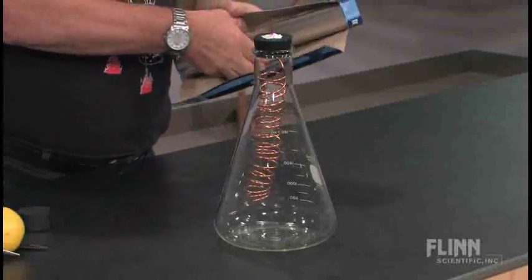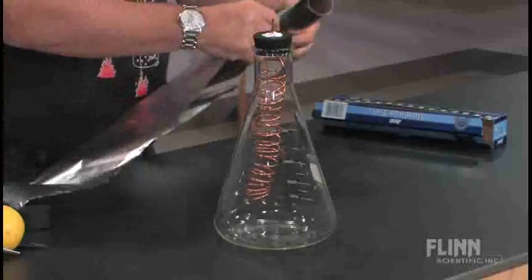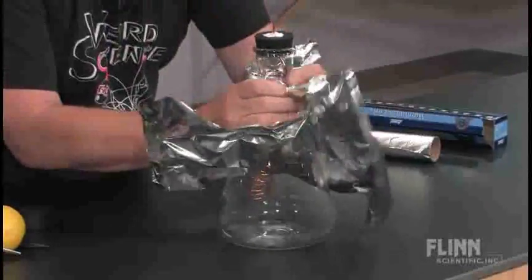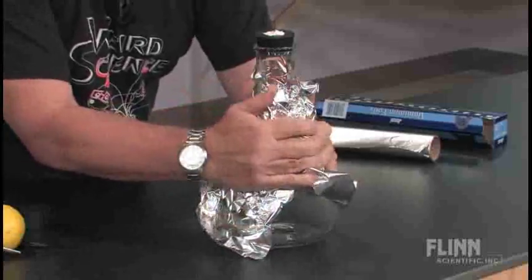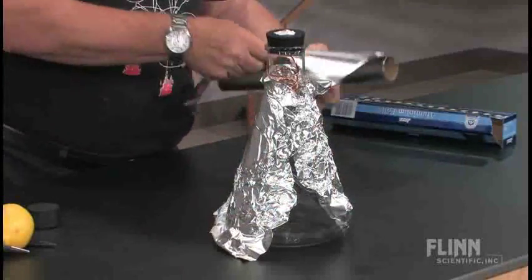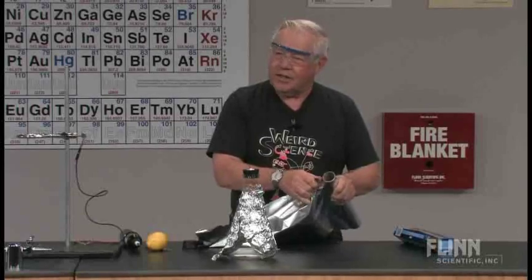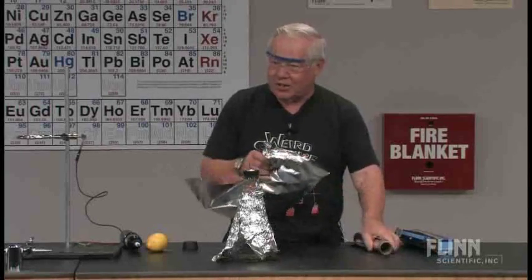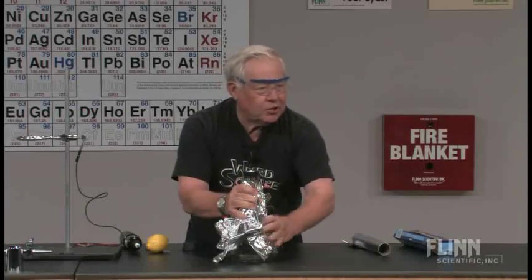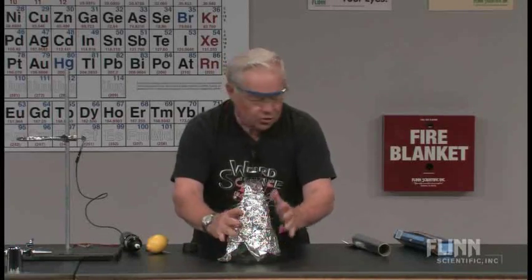We are going to wrap some aluminum foil around the flask. And what we're going to try to do is use some electrical energy to generate some ozone, because inside the flask we have oxygen, O2, and we're going to zap that with some voltage — put some potential and try to get the oxygens to change and create ozone.